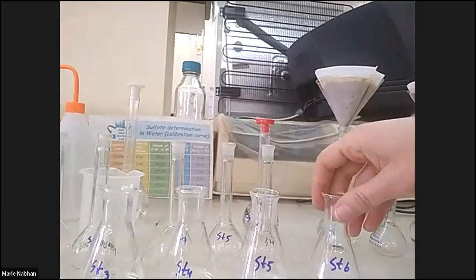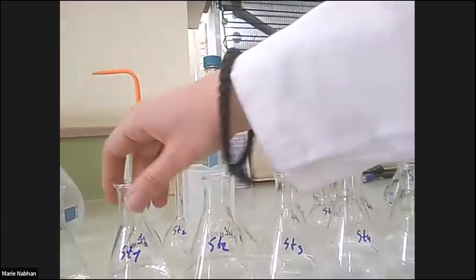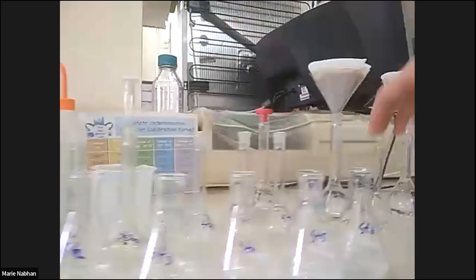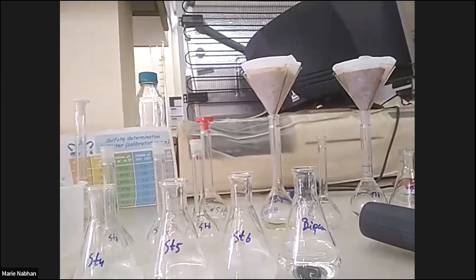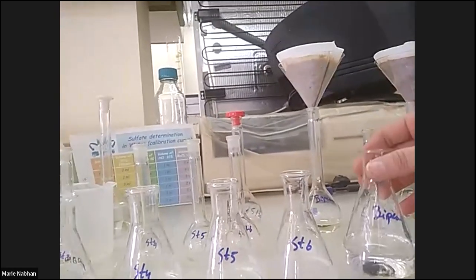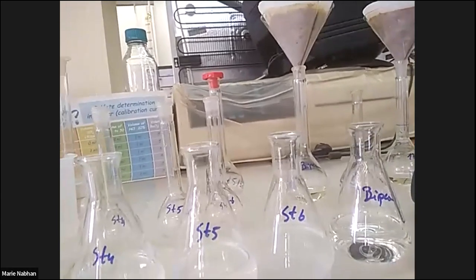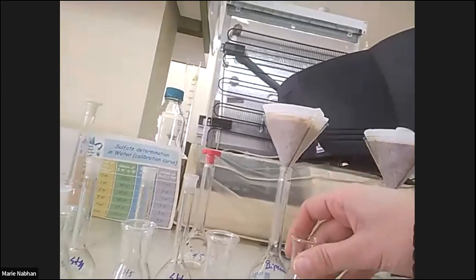So as we see, we have barium sulfate suspended in the solution. It seems that for the soil, I made too much dilution, because the solution is still clear.